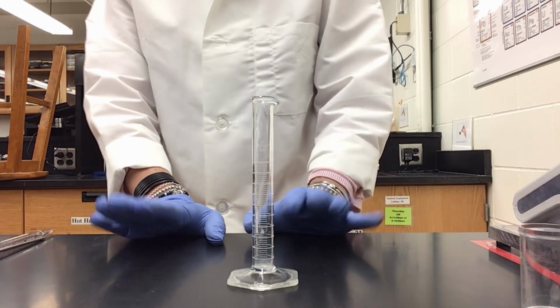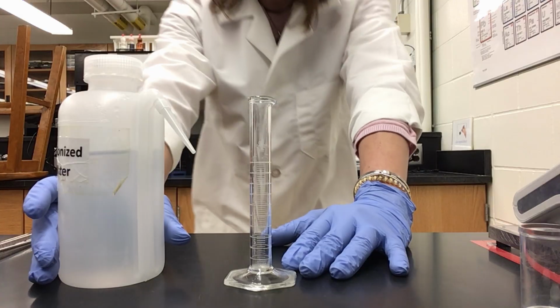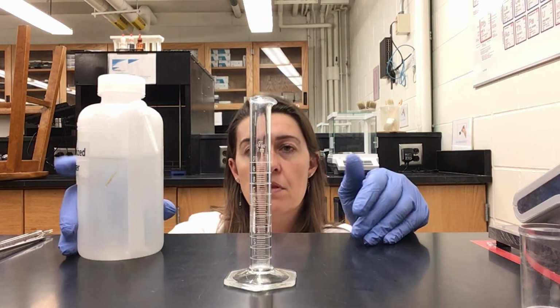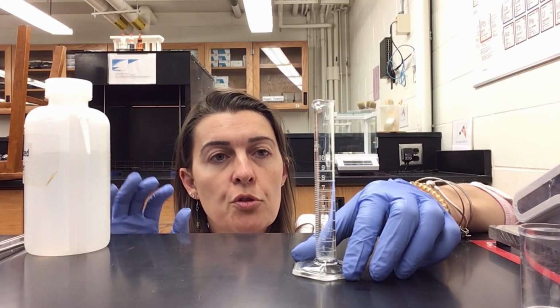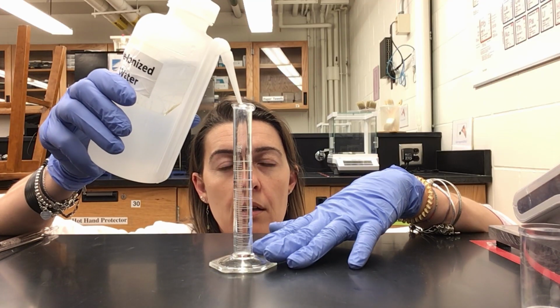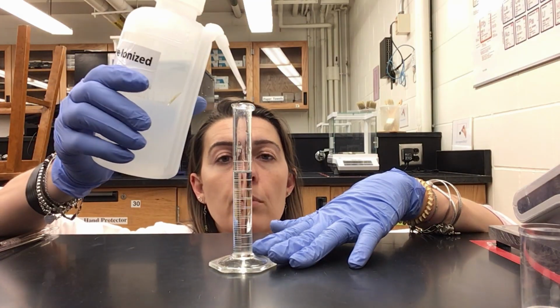So now I have to measure 10 milliliters of water 3 times with the 10 milliliter graduated cylinder. So I am gonna take my deionized water, and I need to position myself in the correct way in order to be able to read the water level appropriately. So what I'm going to do is I am going to kneel, and do you see this? This is the 10. So I need to put my eyes at the level of the 10 milliliter marking straight, okay? So that when I put water, slowly, okay, so now I'm almost at 10 milliliter.